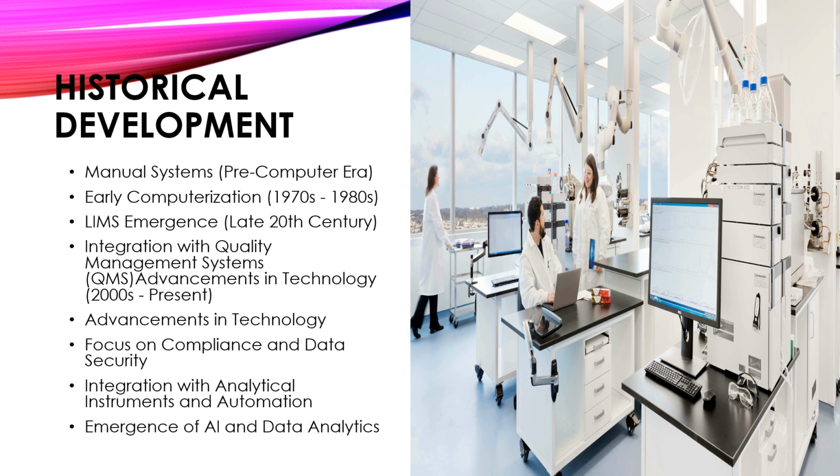Now, next was early computerization, which was between the 1970s and 1980s. With the introduction of computers in the mid-20th century, laboratories began to adopt basic electronic systems for data storage and analysis. And these early computer systems were often standalone and primarily focused on data management rather than comprehensive laboratory management.